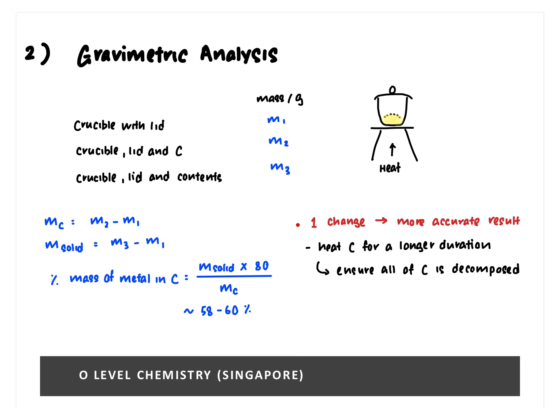So again, this should be a pretty straightforward experiment, except that we are using an unfamiliar apparatus, which is your crucible with lid. Now, actually, school labs should have been equipped with crucibles with lids, just that we haven't used them in like the past decade or so, and they are primarily the home to spiders and many other insects until we forcefully evicted them for this exam.